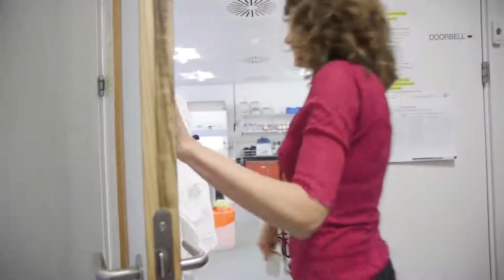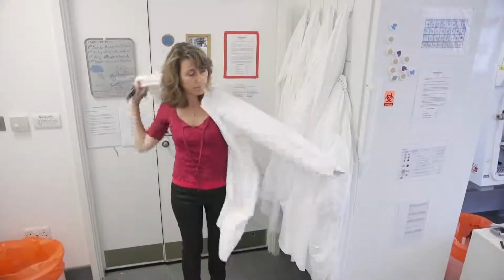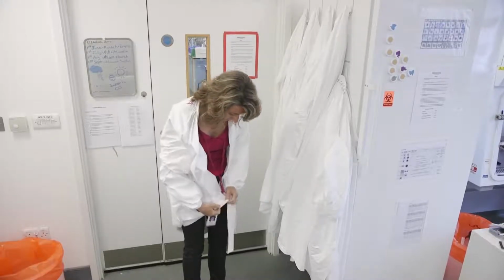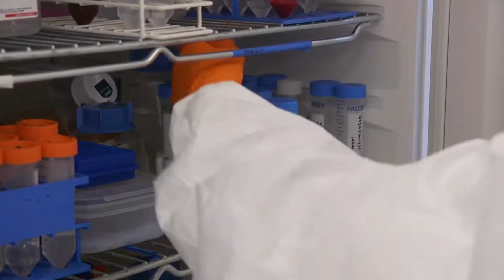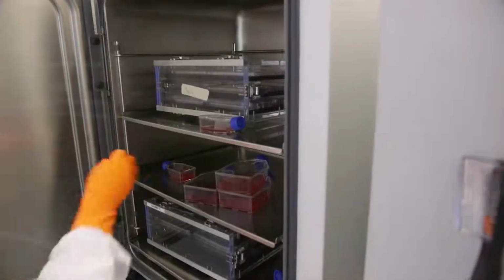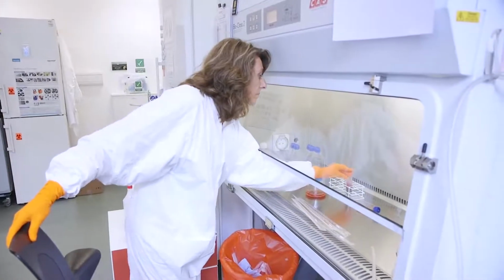The purpose of the CL3 is to protect the workers outside as well as those inside working with the infectious organism. For this, we need protective clothing in the form of a lab coat and gloves. We culture the parasite in plastic flasks and petri dishes, using blood from the NHS Blood and Transfusion Centre. Malaria parasites need special conditions to grow in the lab: a specific mix of gas, a 37-degree environment to mimic the body temperature, and a fresh supply of blood.